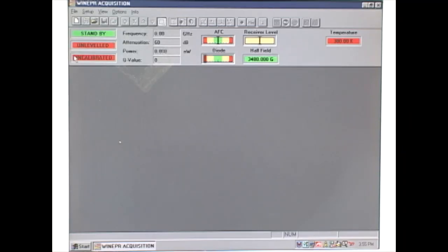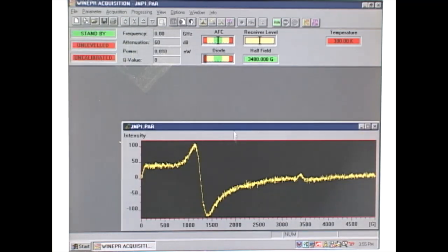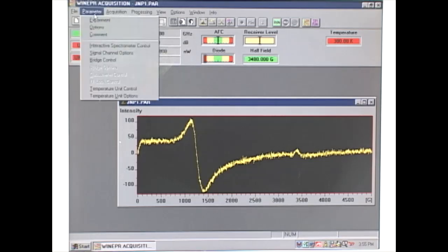Now that we have our sample in the cavity, we open the software. We go to file and open an old file, then go to parameter and bridge control.